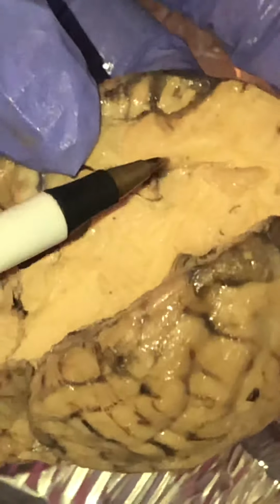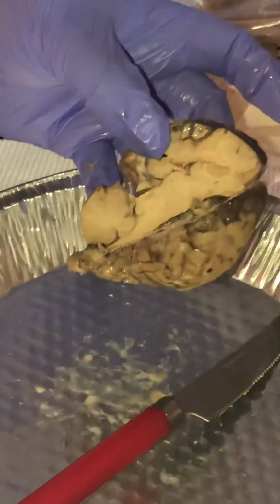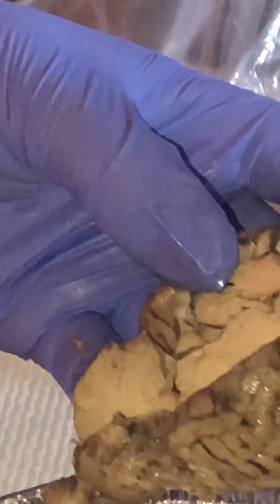The corpus callosum, I'm sorry, the thalamus is right here. Okay, this is the thalamus right here. And the thalamus is grand central station. So information is received here, and then it goes to where it needs to be. It's not processed. It's just received here. Okay? And then it goes to where it needs to go, and you refer to this as Grand Central Station.